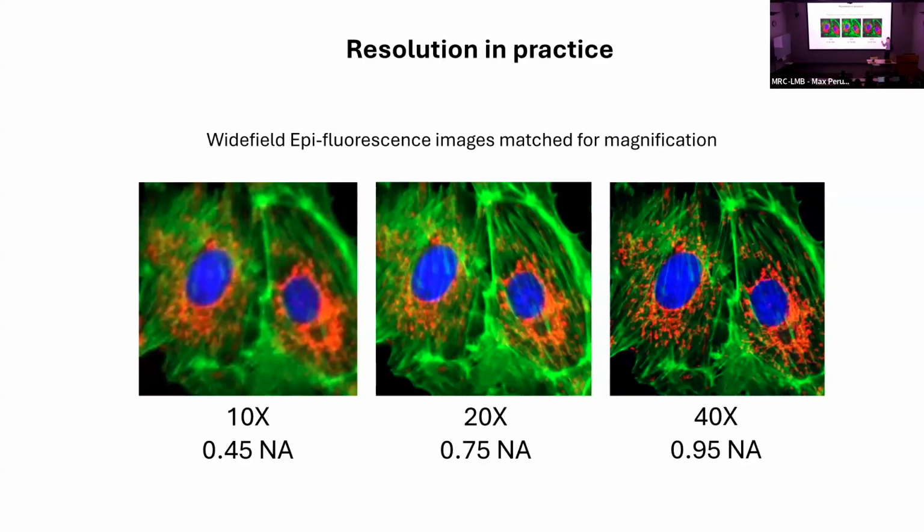Try and get something suitable. This one is a really good happy medium, and this particular lens is still an air lens, so you get lots of resolution, but because it's an air lens with a reasonable working distance, this is very, very conducive to automation. So you can do a lot of hands-off work with a lens like that one.